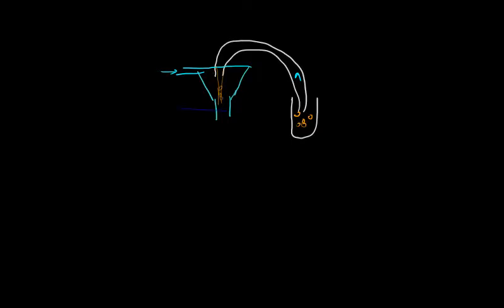There is a laser illuminating the samples, and as the cells are crossing the laser, it's illuminating the cells, and the signals are collected, be it forward scatter, side scatter, or fluorescence. This signal is displayed on the computer and on our plots.